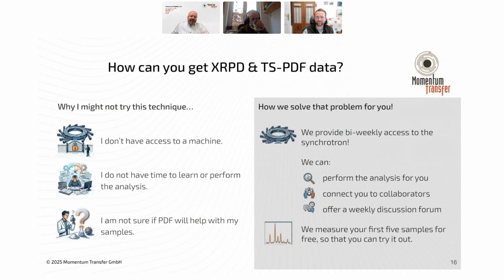Yeah, so how can you get XRPD and total scattering PDF data if you don't have access to a synchrotron right away? We measure roughly every second week at the ESRF. We do perform the analysis for you if you're from industry.